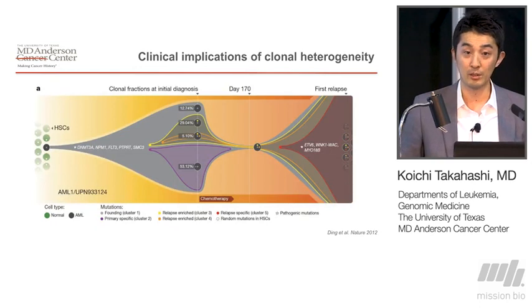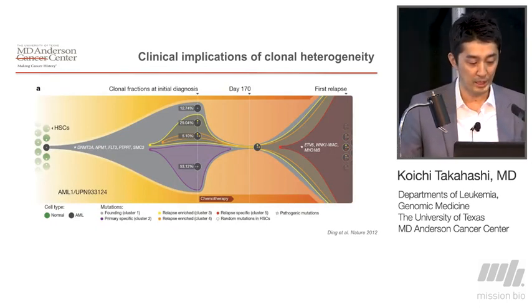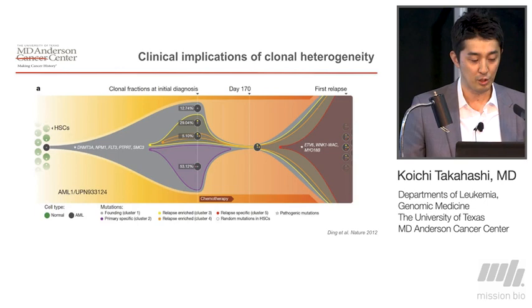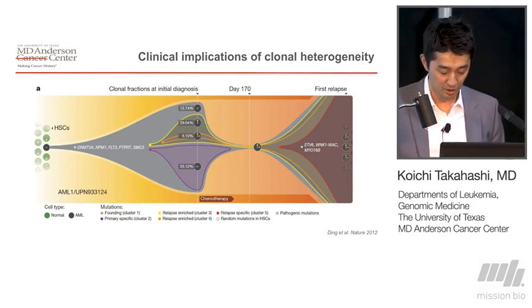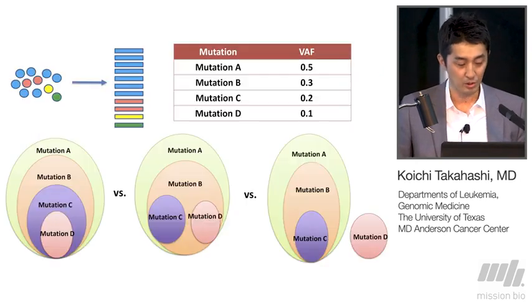And it also has a clinical implication, because the WashU people nicely illustrated, using the bulk sequencing method, that identifying a subclone at the time of pretreatment can constitute the relapse. So really precise characterization of clonal architecture also has some clinical implication.